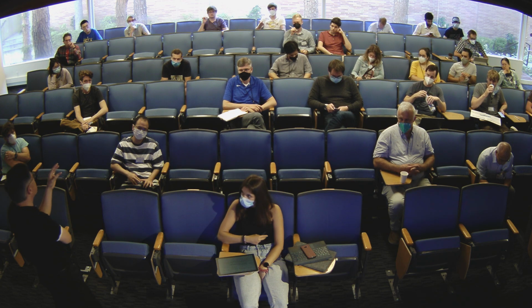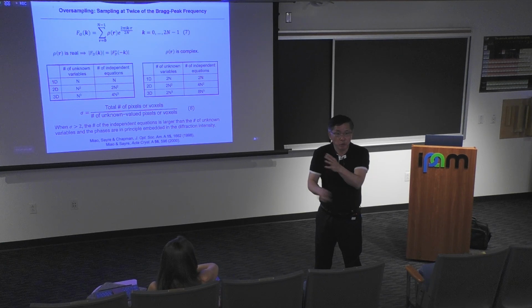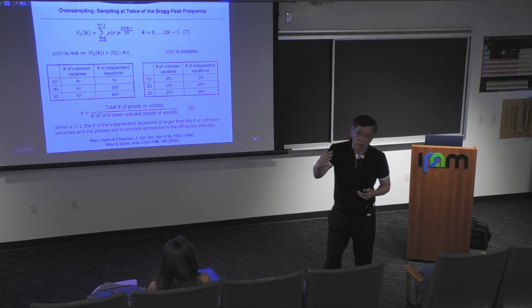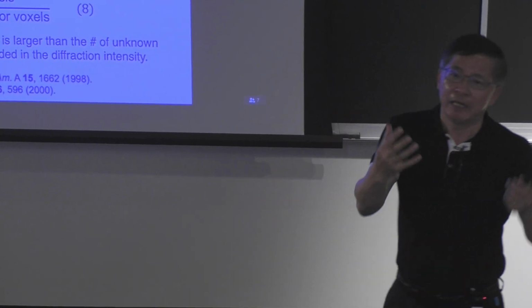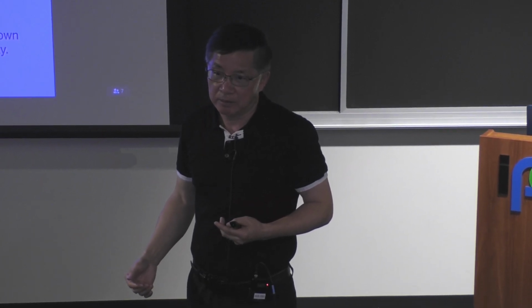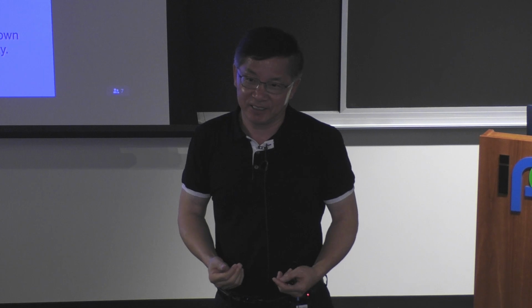Well, if you think about it, going from real space to Fourier space, yes. But for all the experiments, you measure the Fourier space intensity. That's the intensity you measured. So it's not an interpolation, you measured that. You have to sample finely, and this is why you can get zeros in real space. You get it? It's not from real space. Nature gave us the real space. Then when we measured, we measured the Fourier space. So what I mean is the support is due to oversampling. Without sufficient oversampling, you don't get the support constraint.